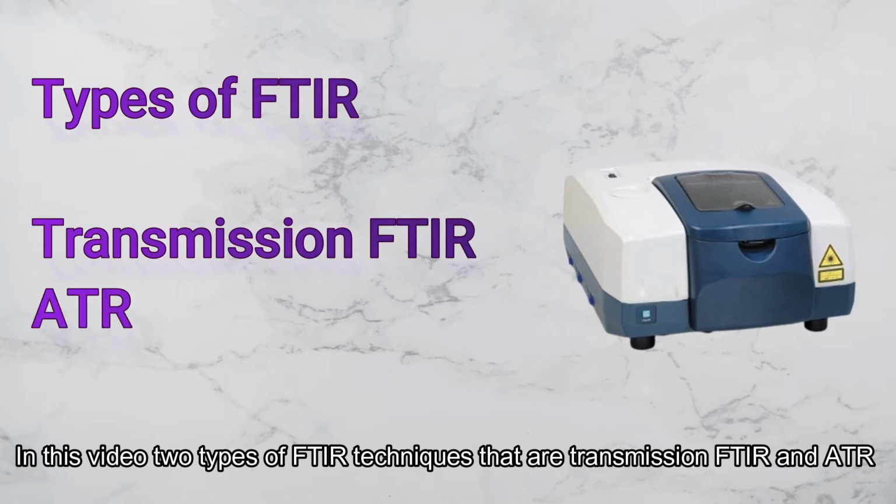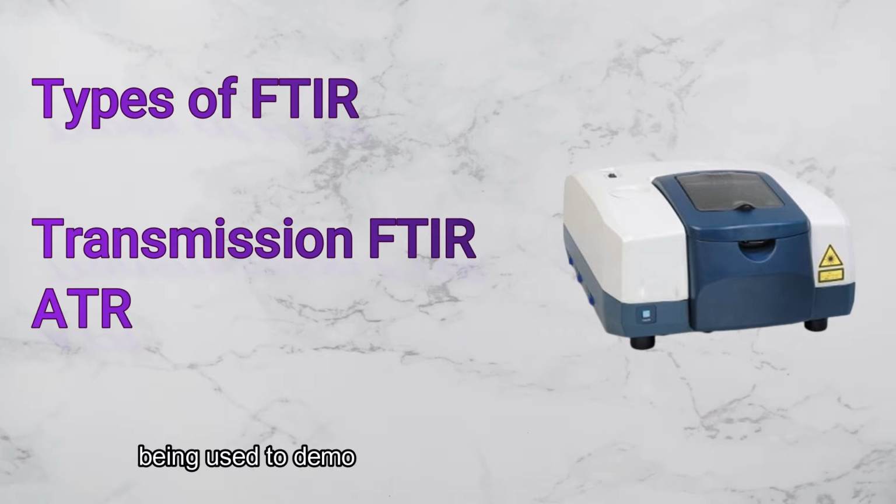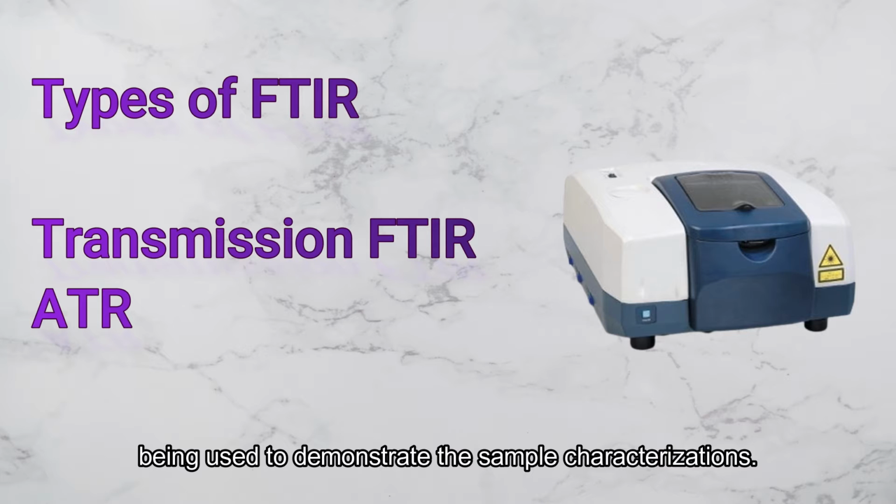In this video, two types of FTIR techniques, transmission FTIR and ATR, are used to demonstrate the sample characterization.